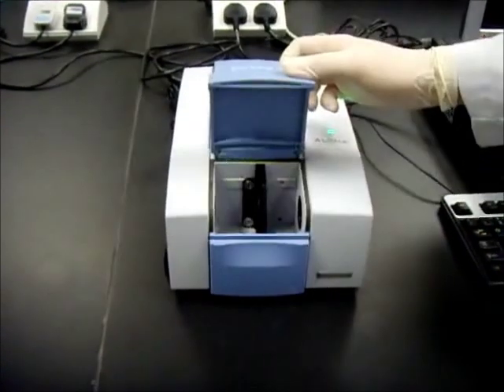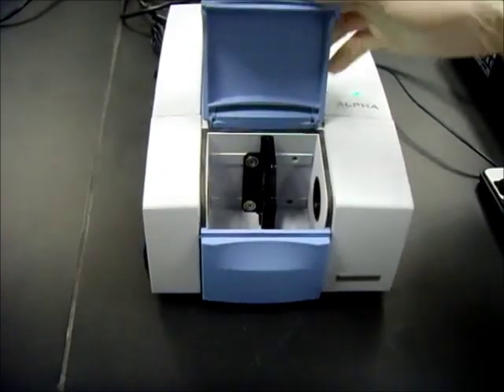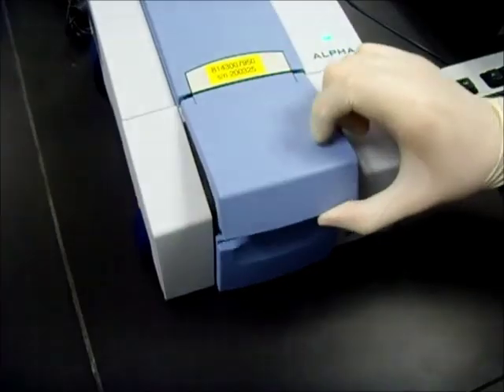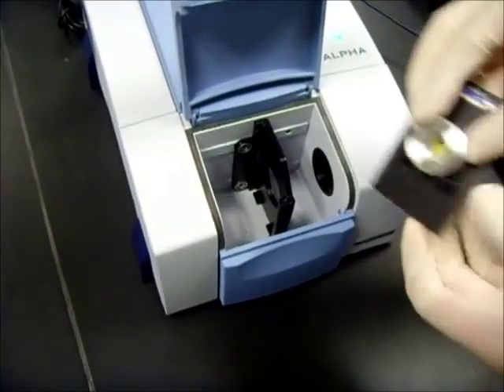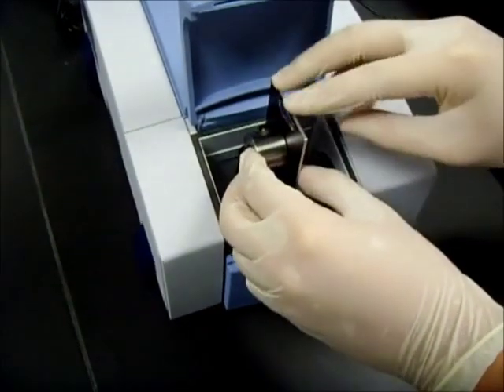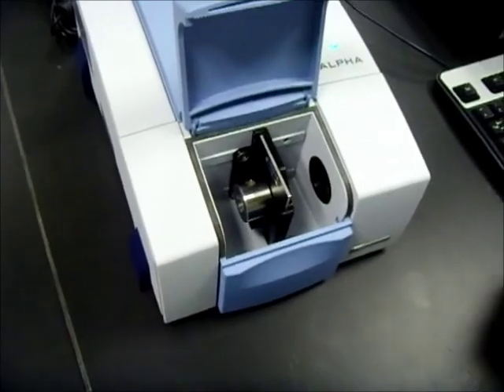Open the cover of the FTIR machine. Check that there is no sample inside, then close the cover. Now click the background scan. Once the background scan has been done, open the cover again. Place the sample assembly onto the holder and put the whole entity into the FTIR machine. Close the cover and click Sample Scan.